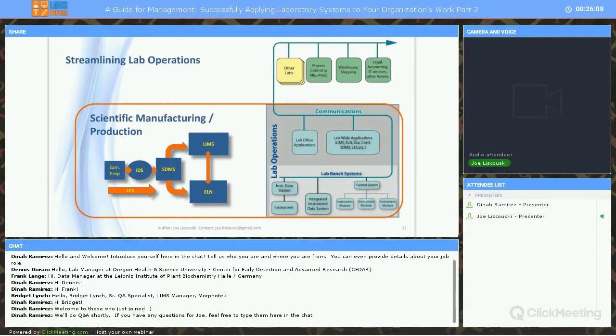Each test or experiment has its own production line, all terminating into the ELN or LIMS as appropriate. The overall logic behind it is the same as any production process optimization, with a goal of high-quality products, in this case, data and information, at minimal cost. Is this possible or realistic? And the answer is yes.